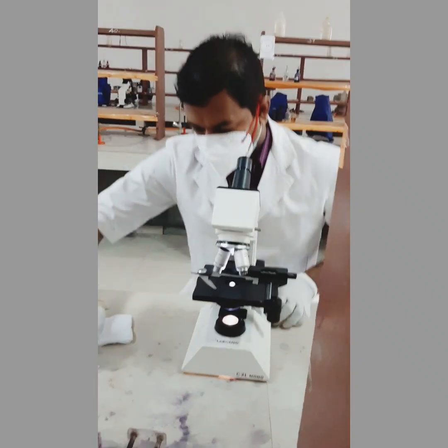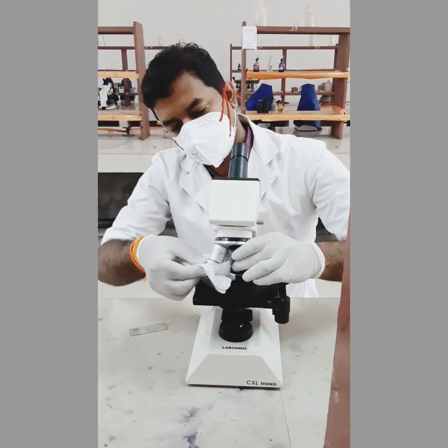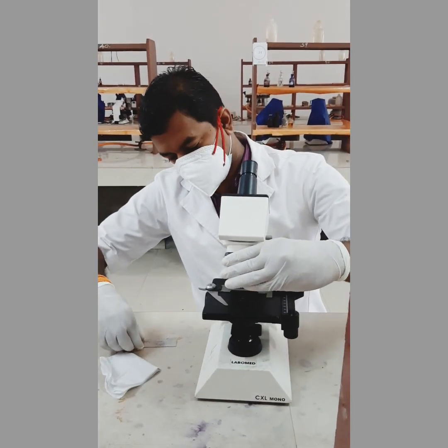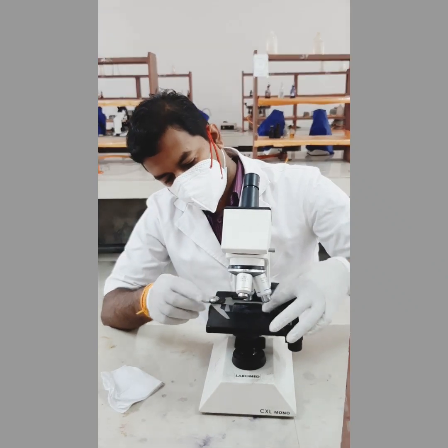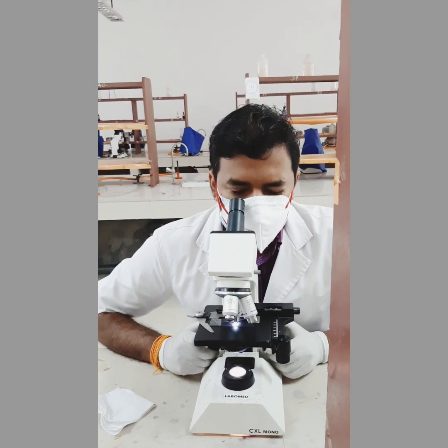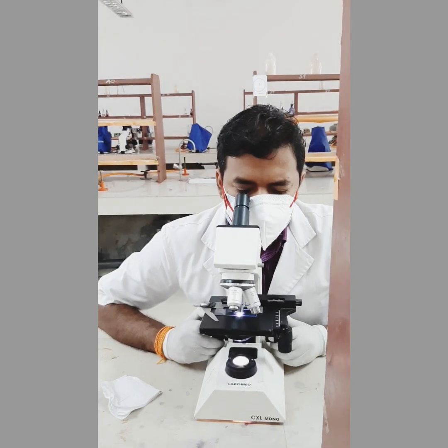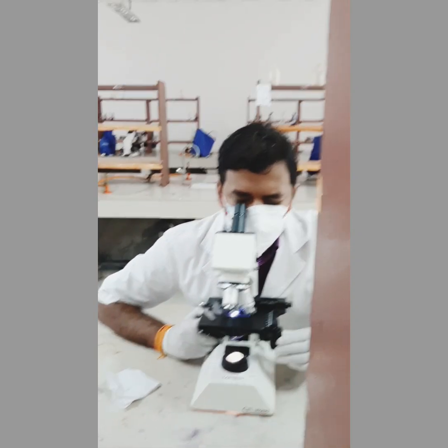Put on the light. You have to clean the oil immersion objective. Keep the slide on the stage, do the adjustments and focus it. First you have to focus the background.